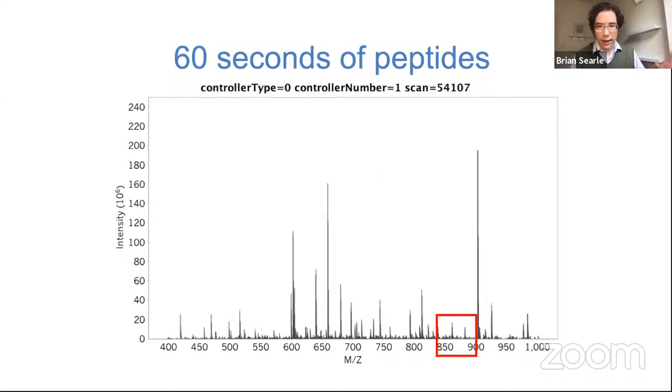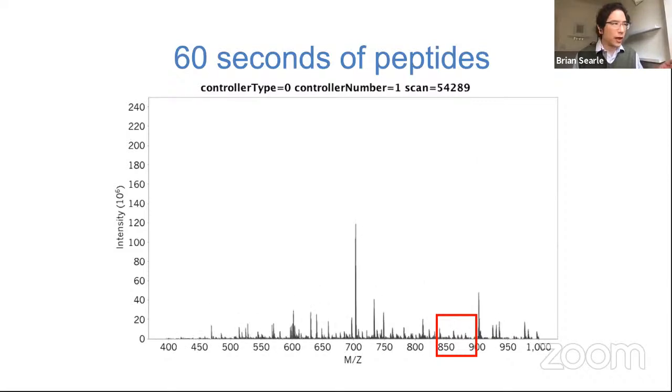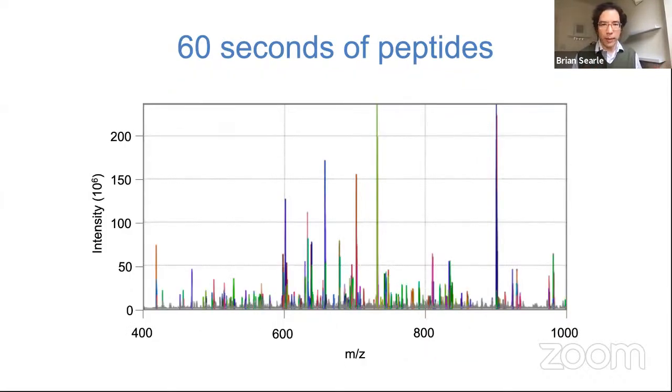So if I take this, again, this 60 seconds of peptide screenshot and show you all of the peptides, in this particular case on a Q Exactive, that I've colored here, these are peptides that are above 1E7 in intensity. That's a very high threshold in terms of peak area. That's much higher than we usually set for our normal dynamic exclusion thresholds, which tend to be around E3, so 4 orders of magnitude separation between them.